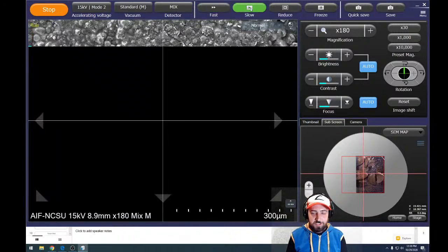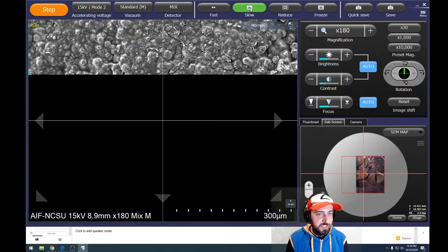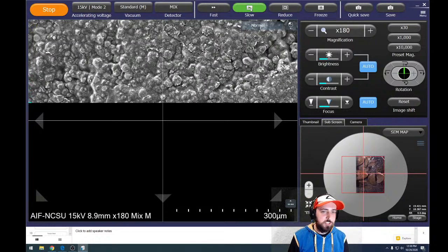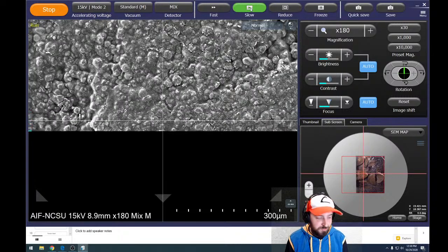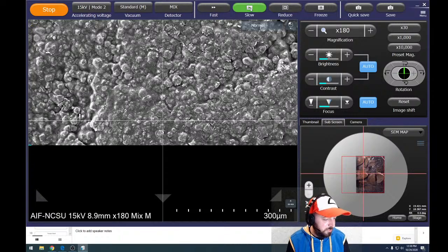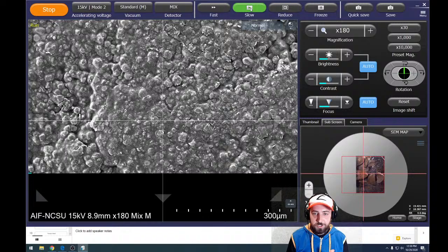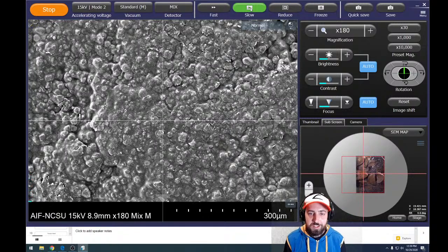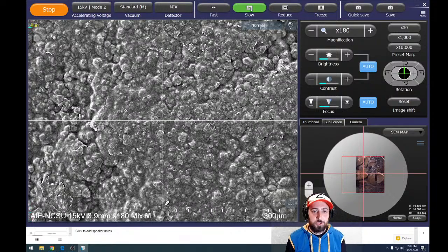So we're seeing about the same texture as what we saw just before, but a little bit more detail. It looks more rocky to me. Before it just looked kind of rough and had texture to it, but now we're starting to see a little bit more pieces and bits in there. And the way they make candy corn is they make a mixture of sugar, corn syrup, salt, and other things, but the main flavor in candy corn is actually marshmallow. So they make a marshmallow cream, and that's the actual flavor of candy corn.